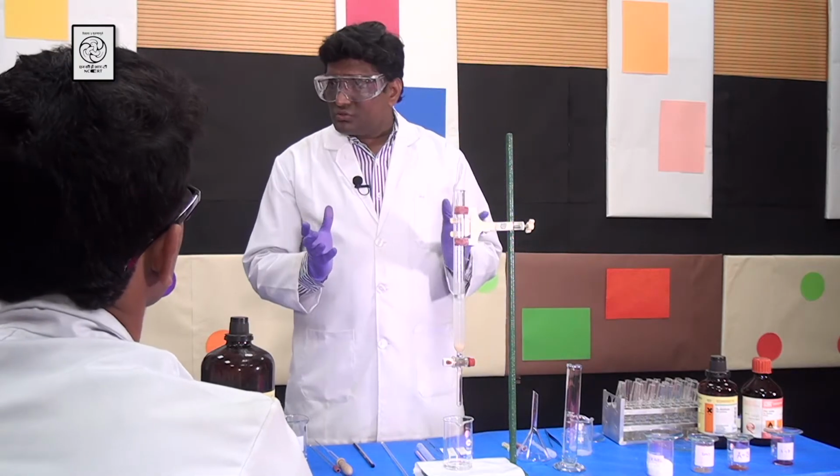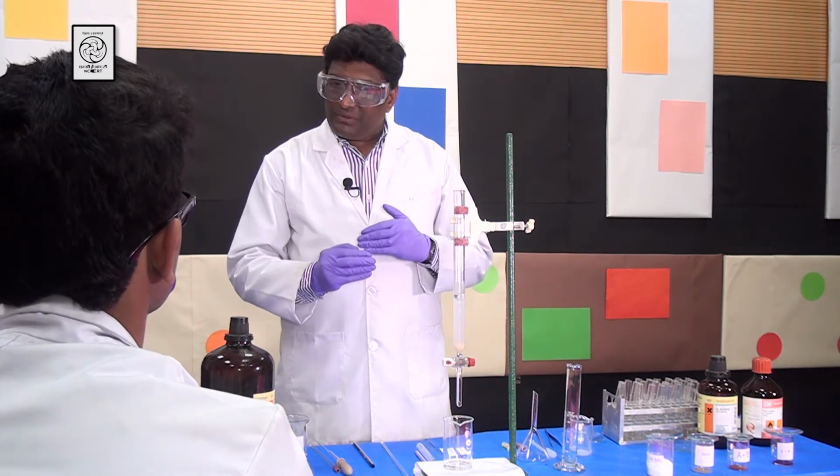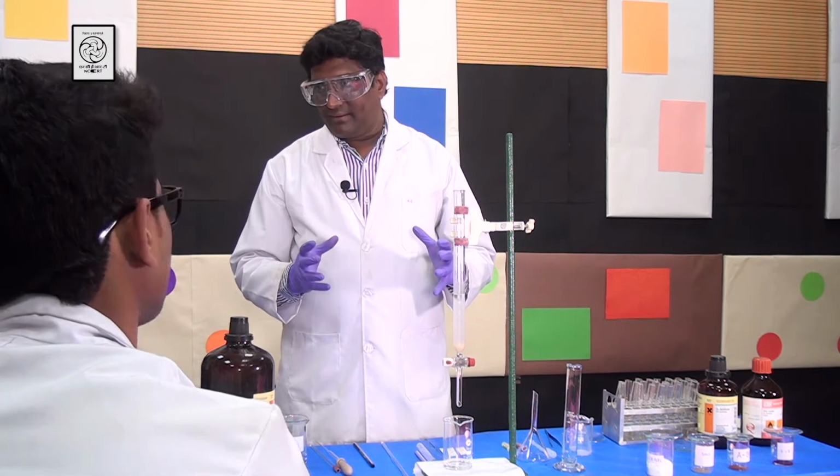Sir, how did you determine the height of the column? There are many factors to determine the height of the column, but most importantly, it depends on the amount of the compound that you want to purify. Okay, sir.